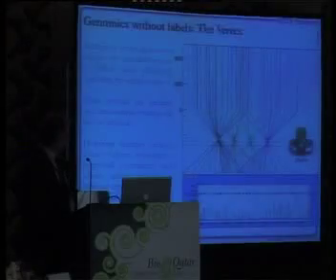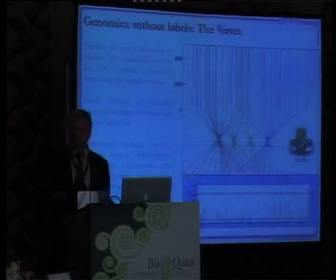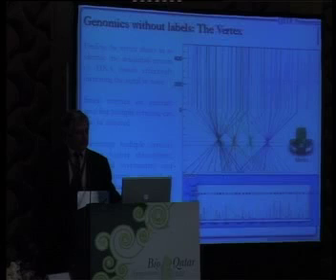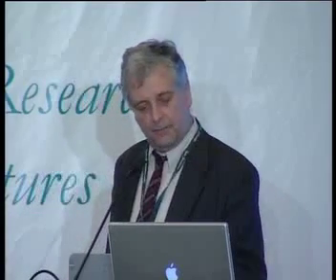This just shows you the DNA work. Using that Vertex technology, we get a sequence out the back end. This is single channel, no labels, and that shows you the cleanliness of how the DNA system works. This shows you short tandem repeat results for forensics and disaster genetics, and you can see very clear signals which would allow identification of people.